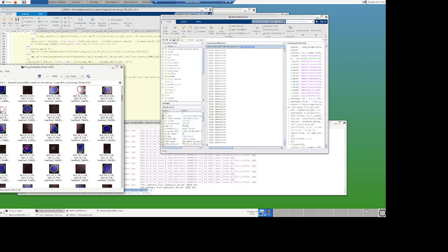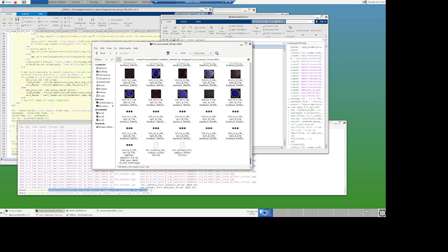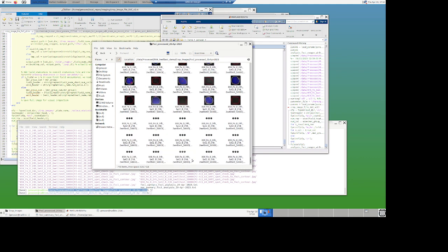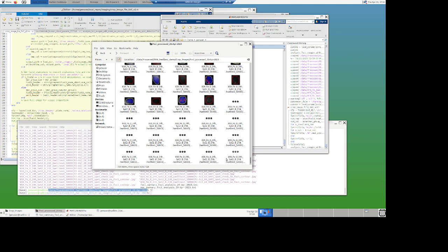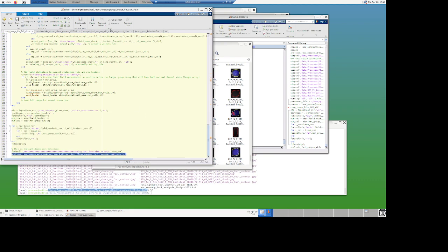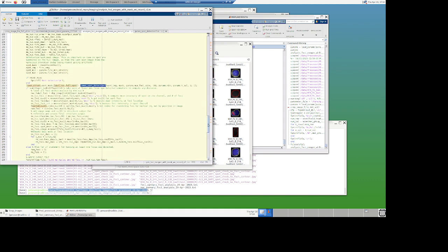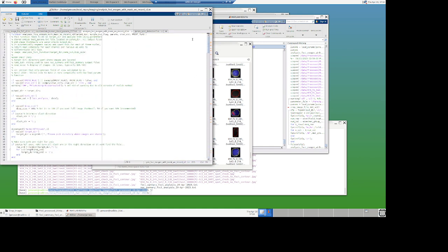Is it still running? I think it is. And as it runs, it creates this output file that we discussed, the nuke summary file and the foci summary. And if we go back here and look at the output, that was one last thing. You should have some listing of what it creates somewhere.